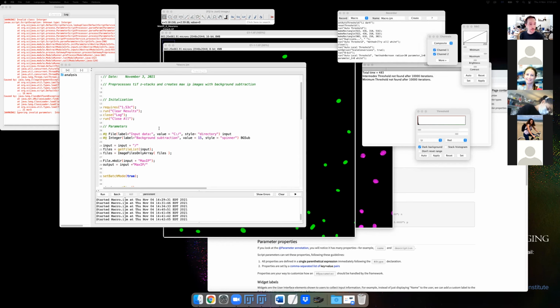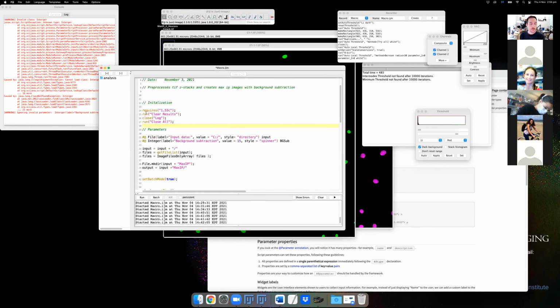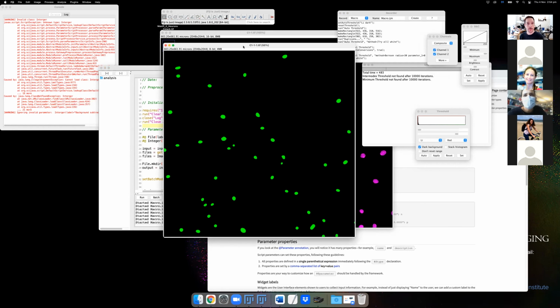Okay, so first of all, if you're doing anything where you're making these binary masks, ImageJ can behave differently depending on how it was installed or what's being changed in it. One of the common problems that comes up, and it may have actually happened to you if you were replicating some of what I was doing here, it can be a really annoying problem where the cells are black and the background's white, and you can have trouble seeing what you're doing. This can be fixed by going into processing binary options and just setting some options. We want to make sure the background is black. And there's a few other things here that are important for some other image processing, but this is what we kind of want for today.